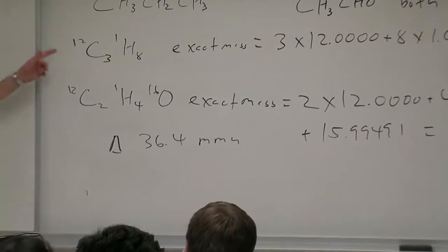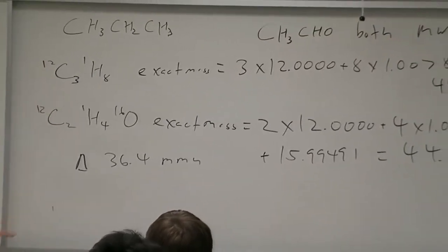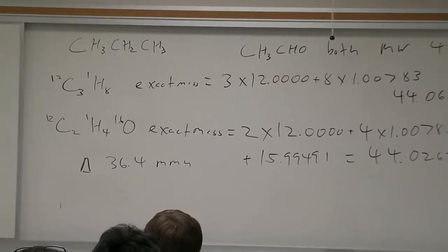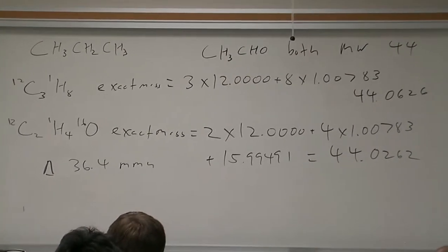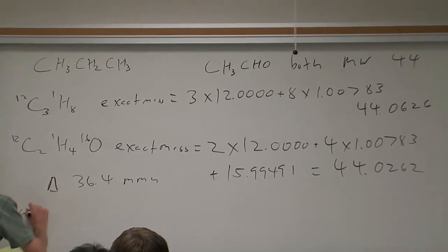And what's nice is you can do more than just distinguish two molecules from each other. For a small molecule, you can have a computer give you all the molecular formulas that fit the exact mass.